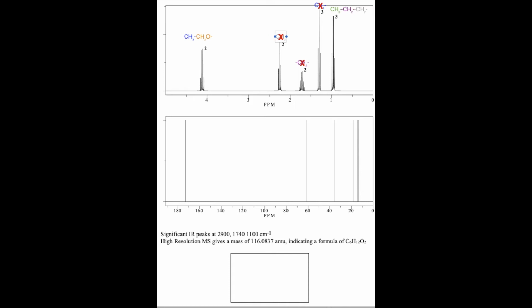And if you look at the actual purple CH2, we already put a big X through it right here at about 1.7 ppm. I don't know if that's 12 peaks or a lot, but it's a lot of peaks. And remember that Pascal's triangle, we saw that those outer peaks tend to get really small as the inner peaks get bigger, and so the outer peaks can kind of get lost in the noise. So yeah, I'll buy it. I'll say that that's just a complex multiplet, and a lot of the little peaks just got buried somewhere and you can't see them.